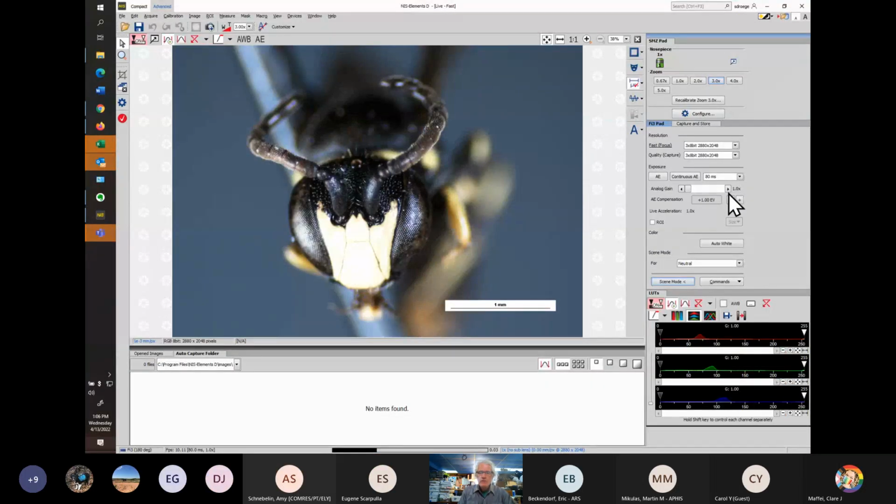We're going to, so see over here, I can actually lighten and darken this specimen by just clicking on some things. So I've purposefully burned out the light colors on that first one so that the dark colors are more visible. But we have now complete control. So this is really nice because we have tons of light here. So I think the problem was the auto exposure, for whatever reason, just decided to expose on down to super dark. So I'll also go to full screen here in a second. Well, I do that now.